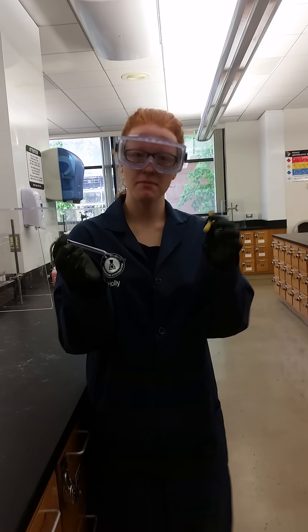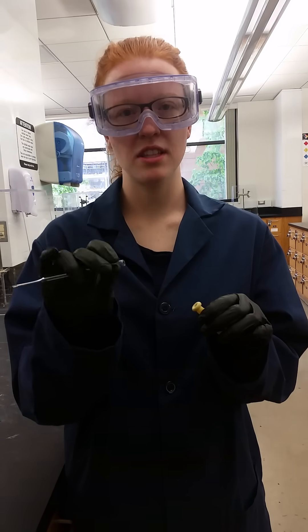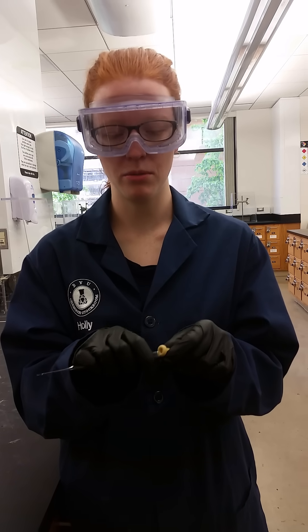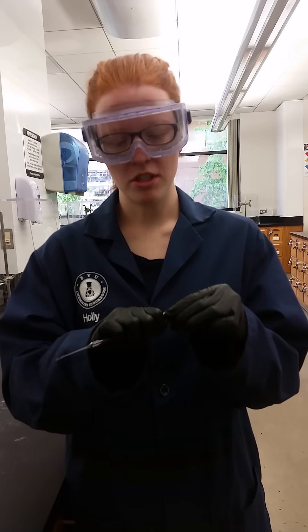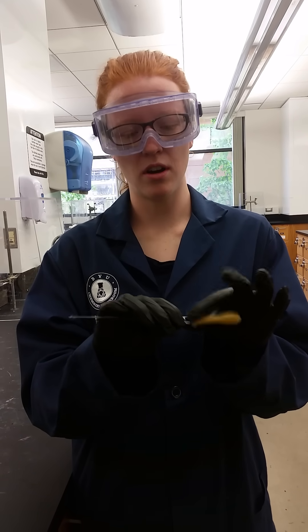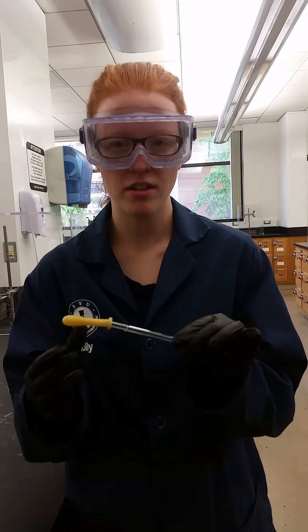I'm going to hold — this is my pipette and this is my bulb. I'm going to hold my pipette close to the end so that I don't break the edges as I try to put the bulb on. I'm going to just gently place the bulb on, but not too far on because it makes it hard to come off.